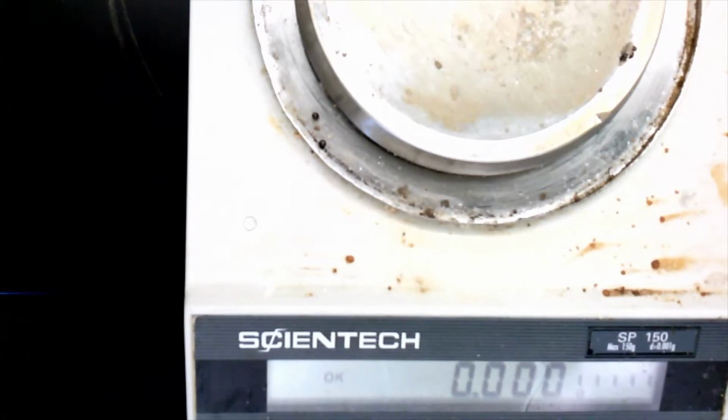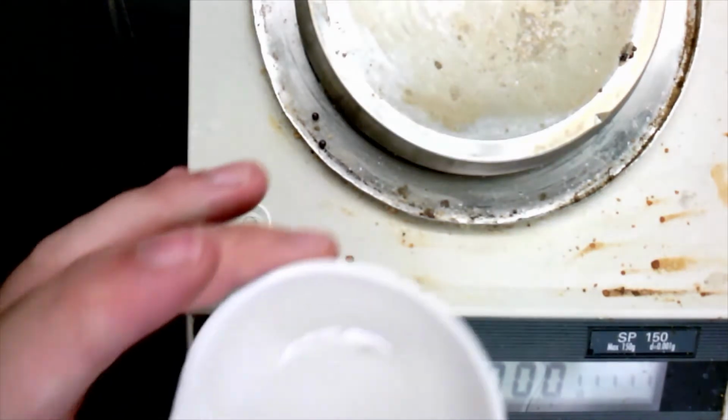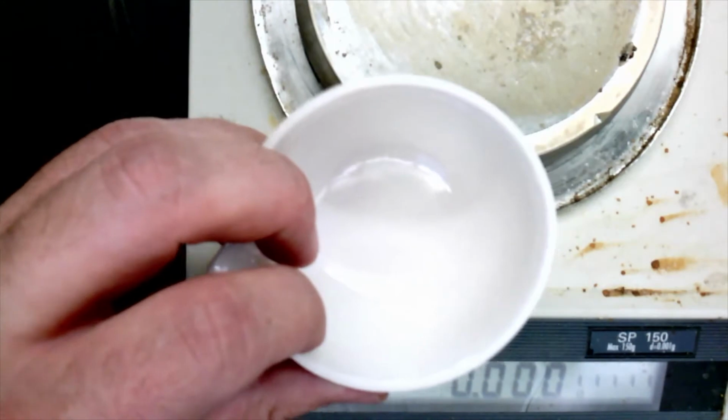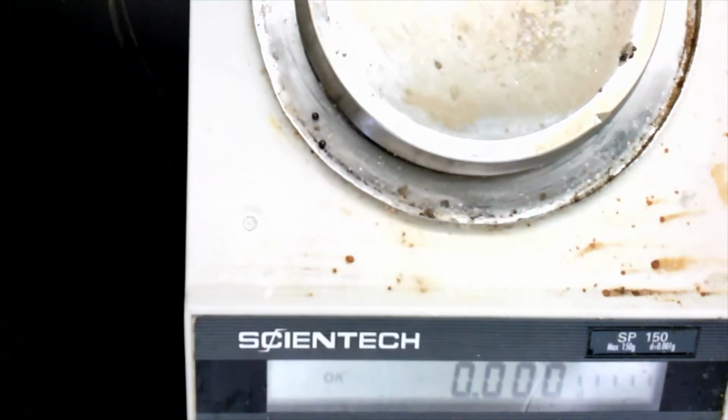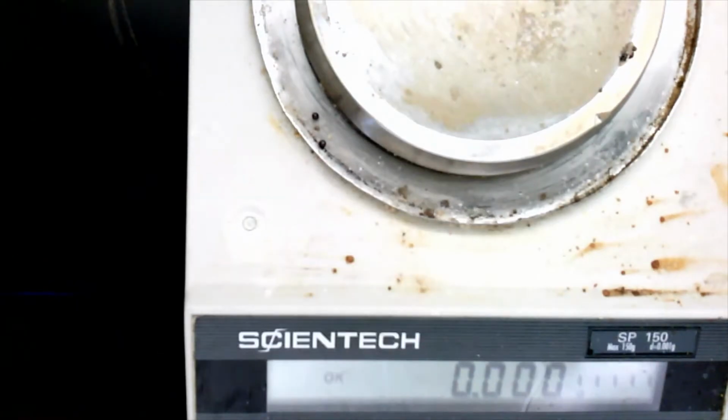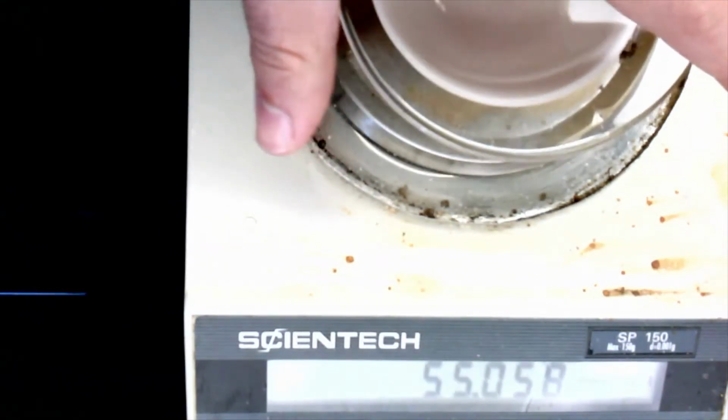And then we need to measure the mass of our large evaporating dish and our watch glass. Okay, so our large evaporating dish looks like this. This is where I'm actually going to put my magnesium ribbon for this first reaction. And the watch glass, we used a watch glass last week. Here's our large watch glass. This is just going to be sort of like a cover for our evaporating dish so that we make sure we don't lose any of our product in this reaction.